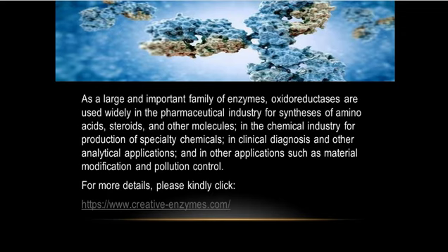As a large and important family of enzymes, oxidoreductases are used widely in the pharmaceutical industry for syntheses of amino acids, steroids, and other molecules, in the chemical industry for production of specialty chemicals, in clinical diagnosis and other analytical applications, and in other applications such as material modification and pollution control.